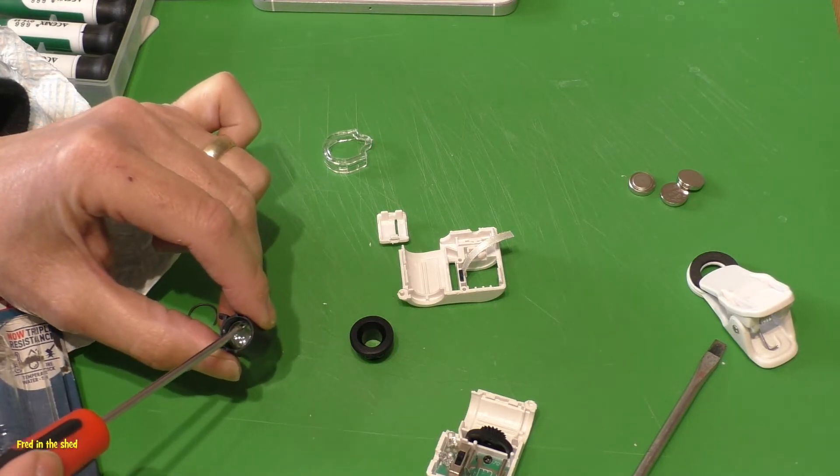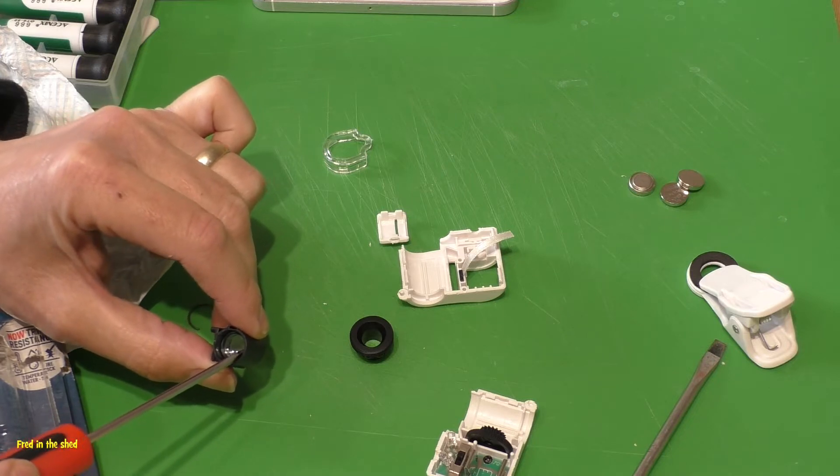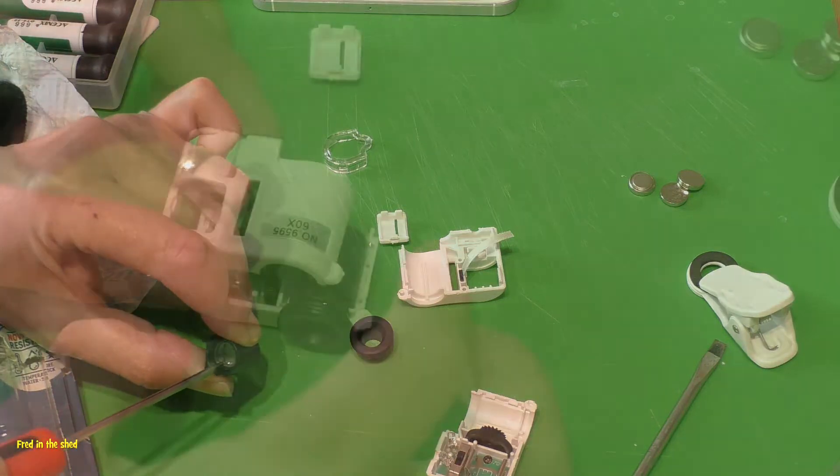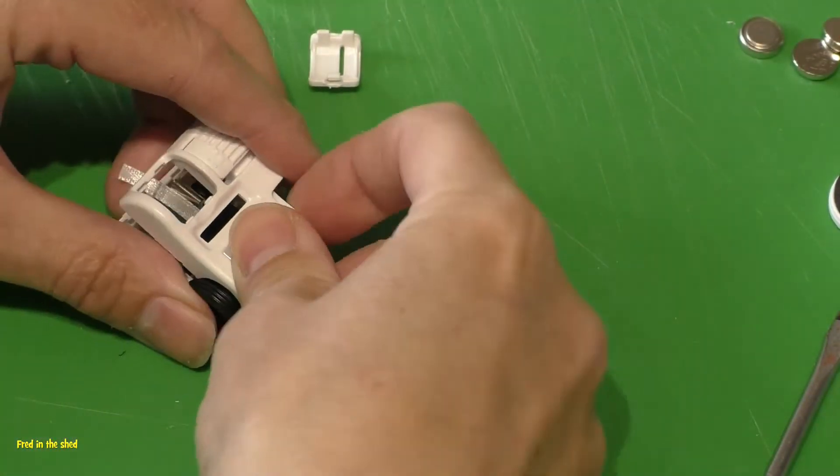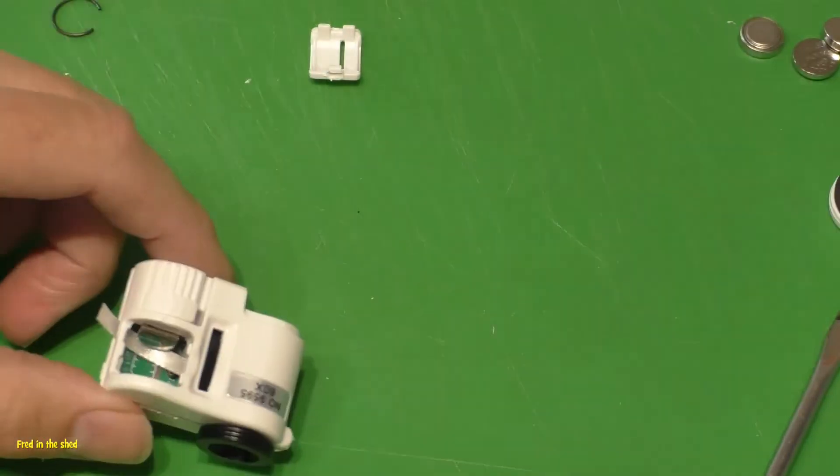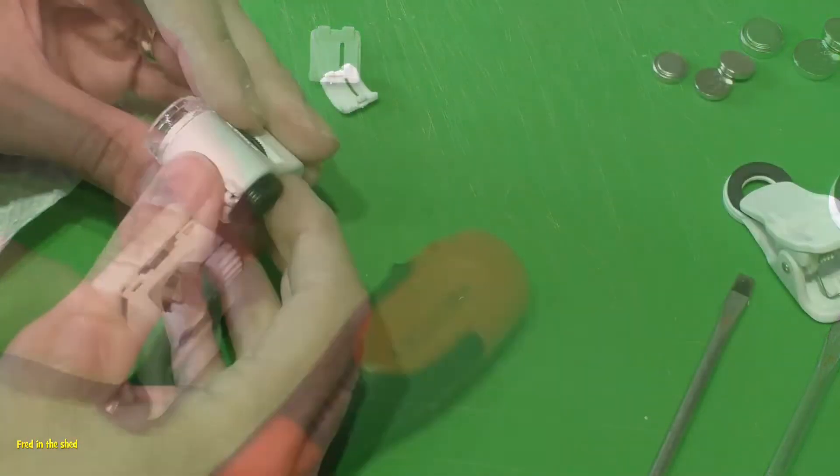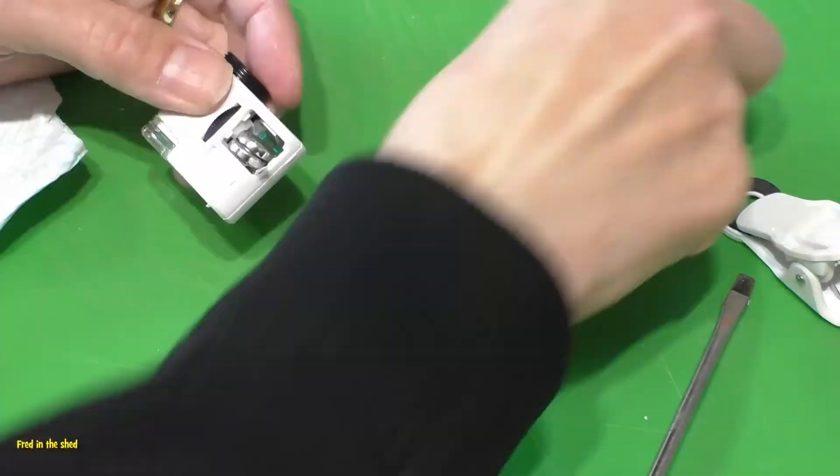Of course, I perfectly understand that very few people are going to do this - most people would just throw it away and groan. But I didn't really want to have to do this. In fairness, it did kind of go back together reasonably easily, and once it was back together, the focus did work quite well.